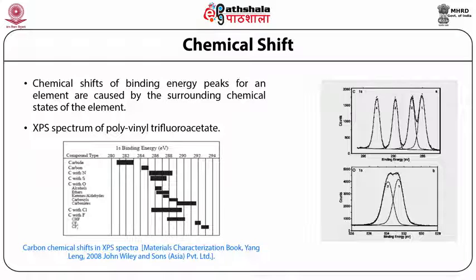Similarly, oxygen atoms in two different environments also generate two peaks as shown in Figure 1b. The XPS spectra shown in Figure 1 with defined peak positions and relative peak intensities can also be used as a fingerprint to identify PVTFA.